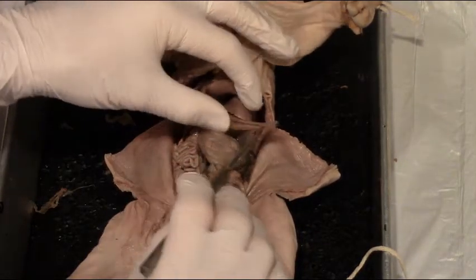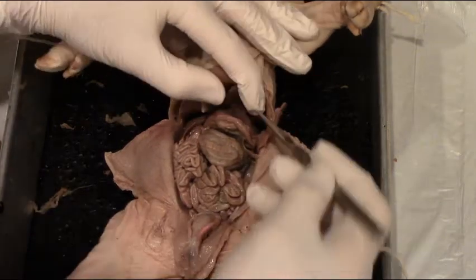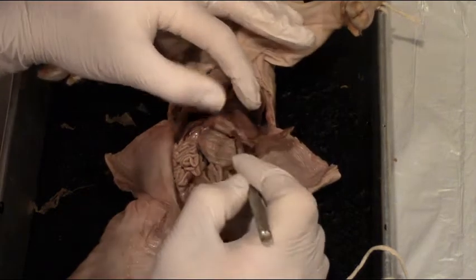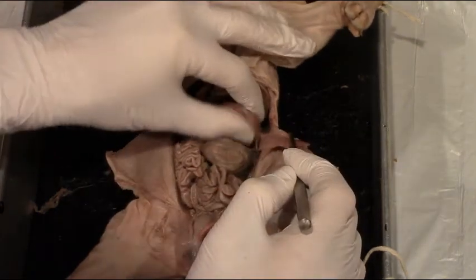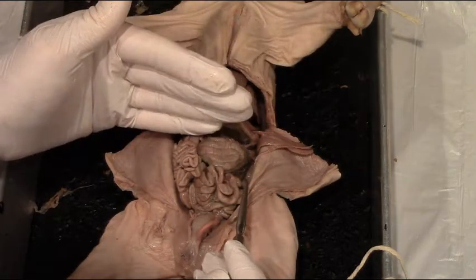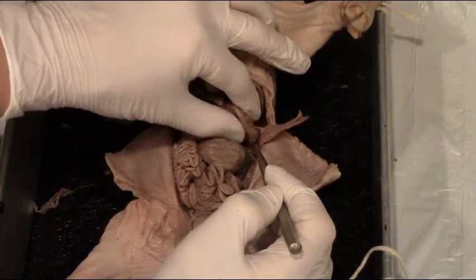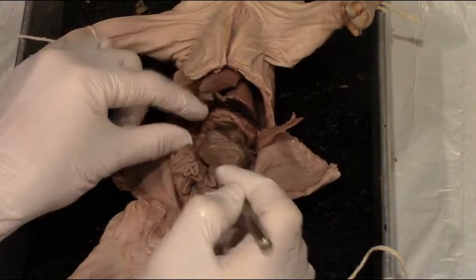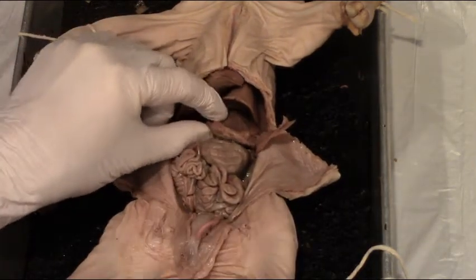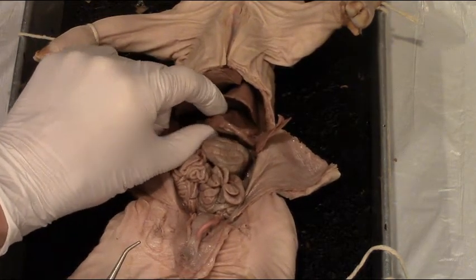If we scoot the spleen over — we already looked at the spleen — and look just posterior to the liver, we can see the stomach. The stomach is this big pouch, just underneath the spleen and just posterior to the liver, and it should look like a big deflated pouch. Feeling along the stomach and heading toward the small intestine, you can feel a really tight knot called the pyloric sphincter.